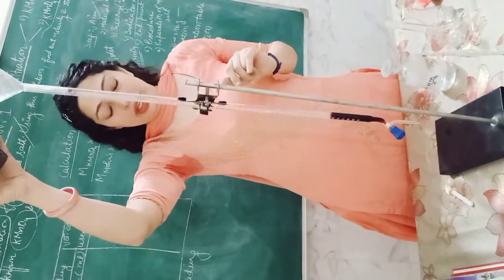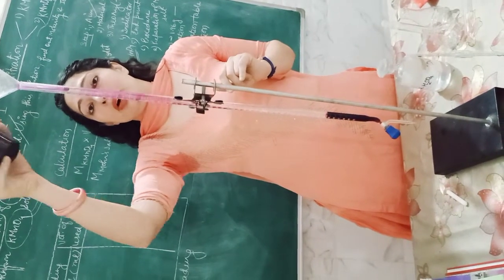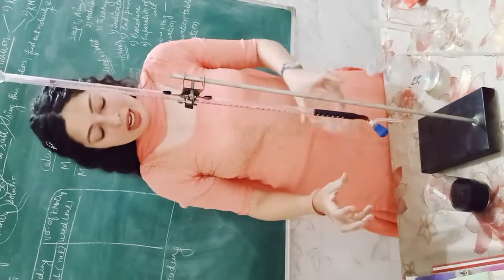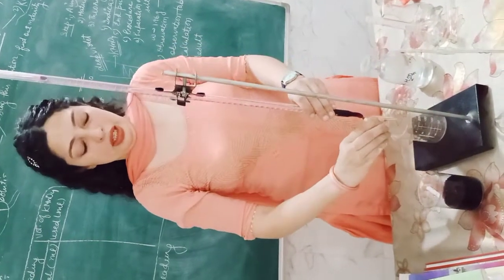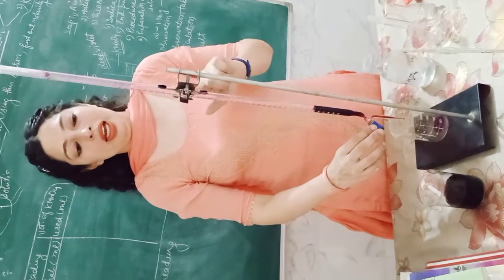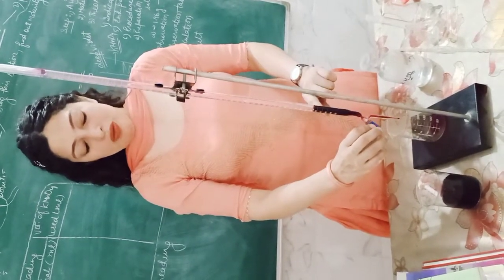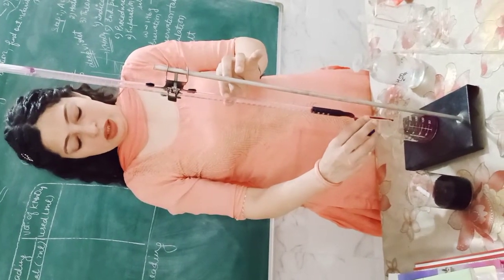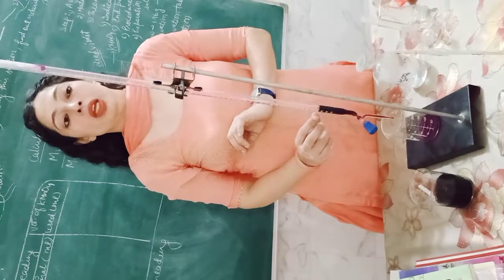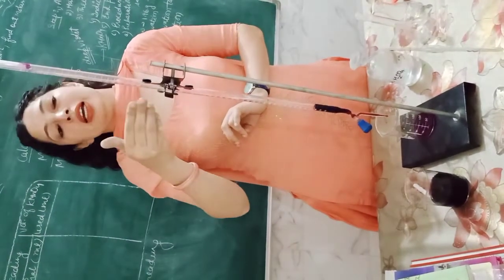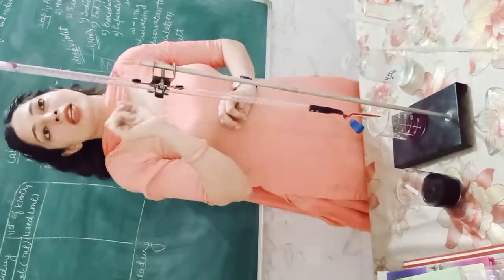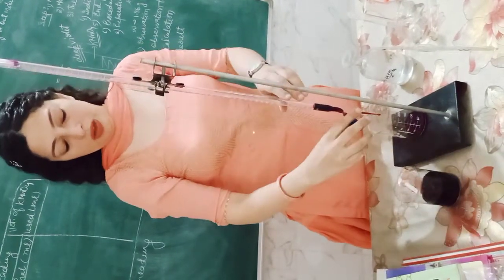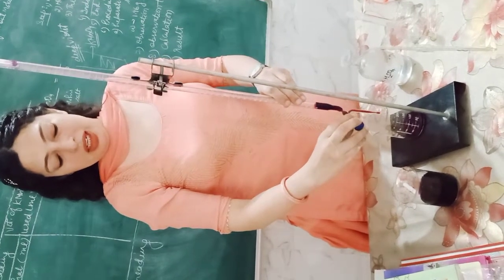You will take KMnO4 and with the help of the funnel, transfer around 1–2 ml into the burette. Then remove it into another beaker. If there is any impurity, it will come out with the KMnO4. This is the way to rinse it — any impurity stuck inside is washed out and collected in the other beaker.